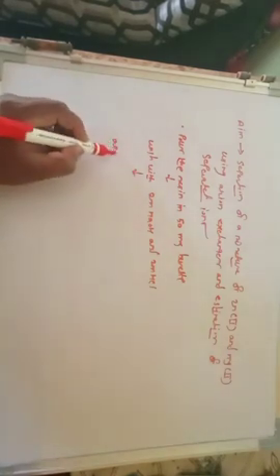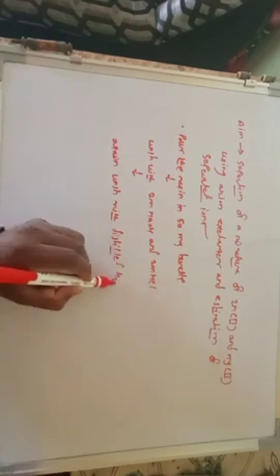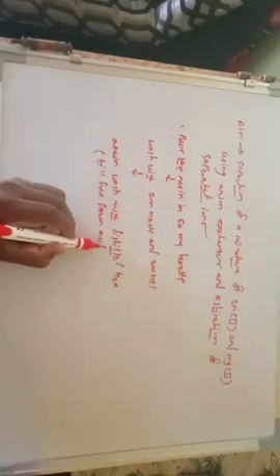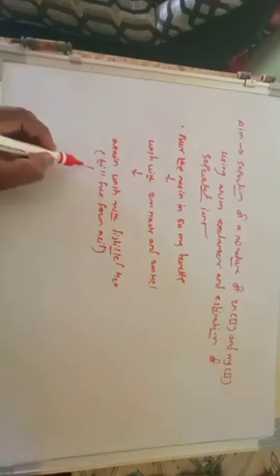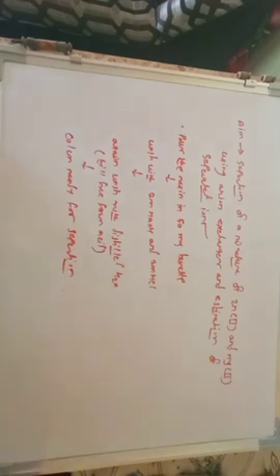Then wash the column repeatedly with distilled water, till free from acid. After that, the column is ready for loading the mixture for separation. Column is ready for separation.